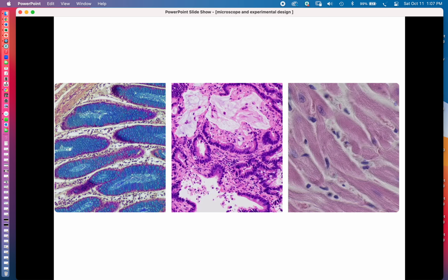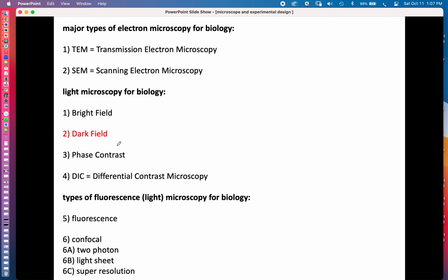And these dyes could stain both clothes and tissues, because the clothes at that time were all made by natural fibers, biological fibers like cotton and wool and so forth. And so it was staining biological material. And so, yep, some of them could also work well to stain samples for cells. And so that's an example of the bright field microscope, wide open view. So the next one we're going to talk about is a neat one because it's just the opposite of that bright field.